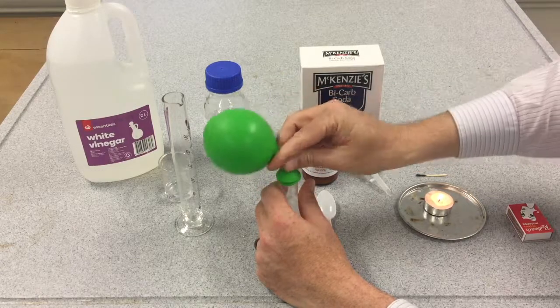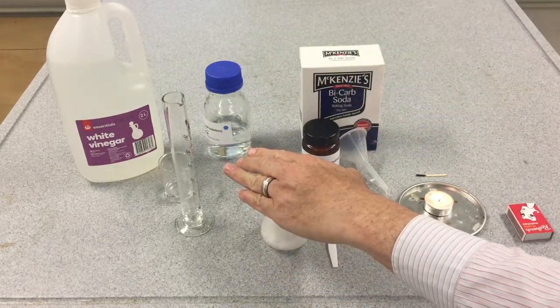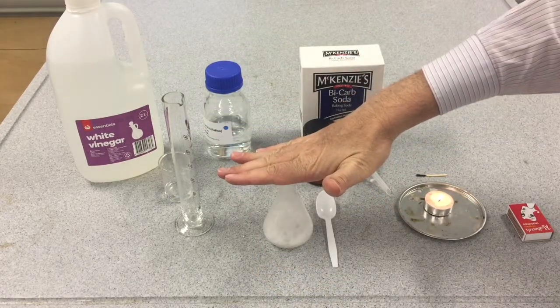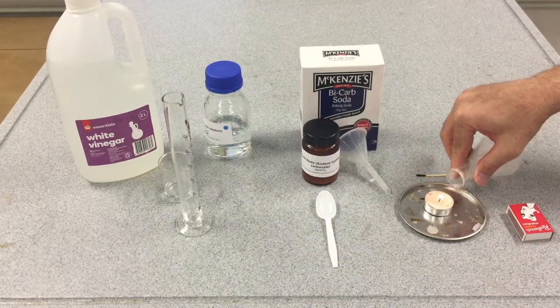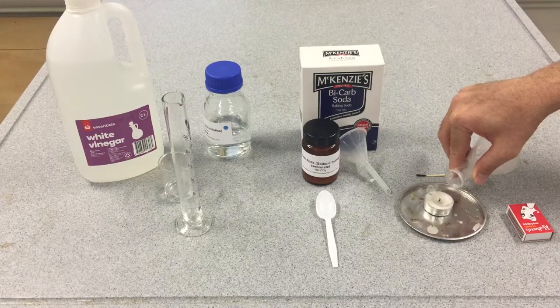Gently take it off and put your hand over the top of the conical flask so any gas in the flask doesn't escape. Take the conical flask and tip it over the candle, but don't let any of the liquid escape, and you should be able to see something interesting happen to the candle.